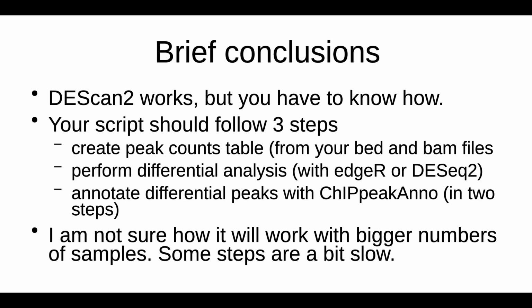I'm not sure, although, how it will work with a bigger number of samples. I tried it with 4 samples, 6 samples, but if there are 10 or 20, then I have some doubts how it will perform. Some steps are really slow.